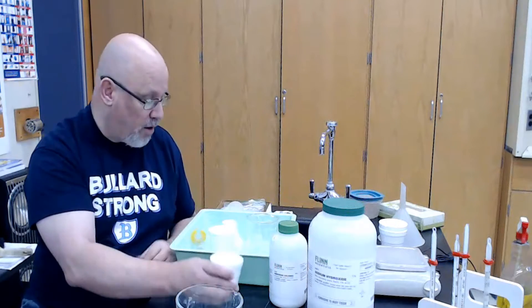Remember, the solution to pollution is dilution. At any rate, you'll be getting in the lab one to two grams of this sodium hydroxide. And we'll be introducing it into a calorimeter that contains 20 milliliters of water.